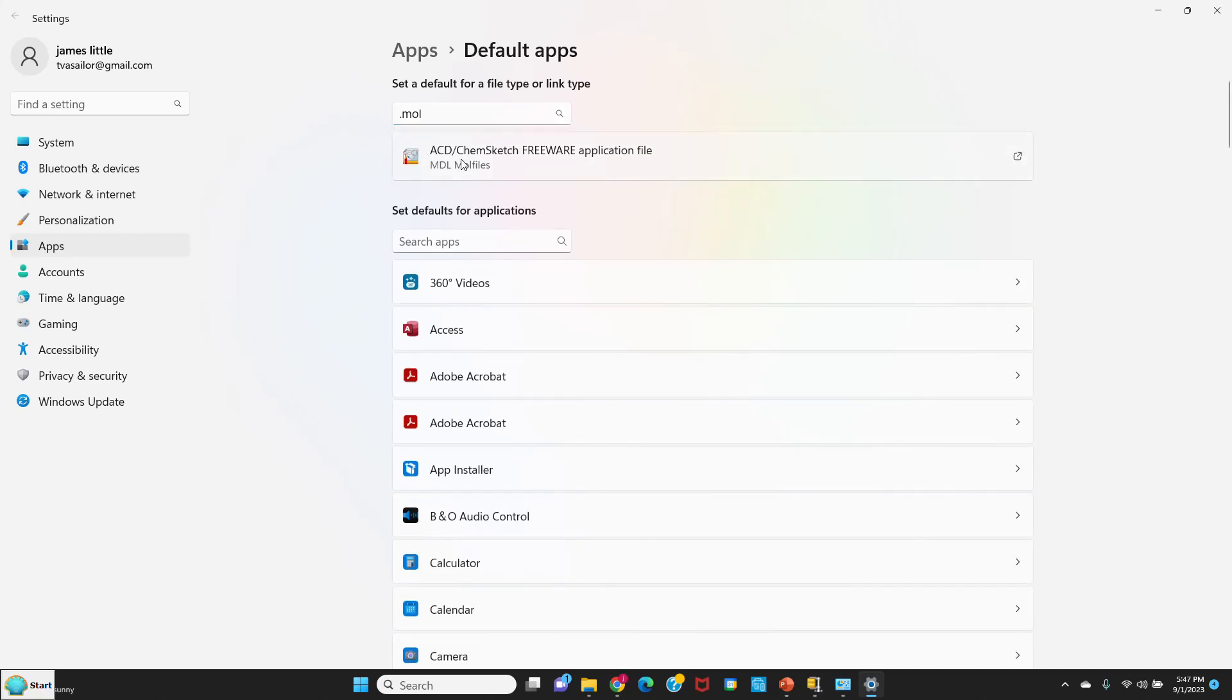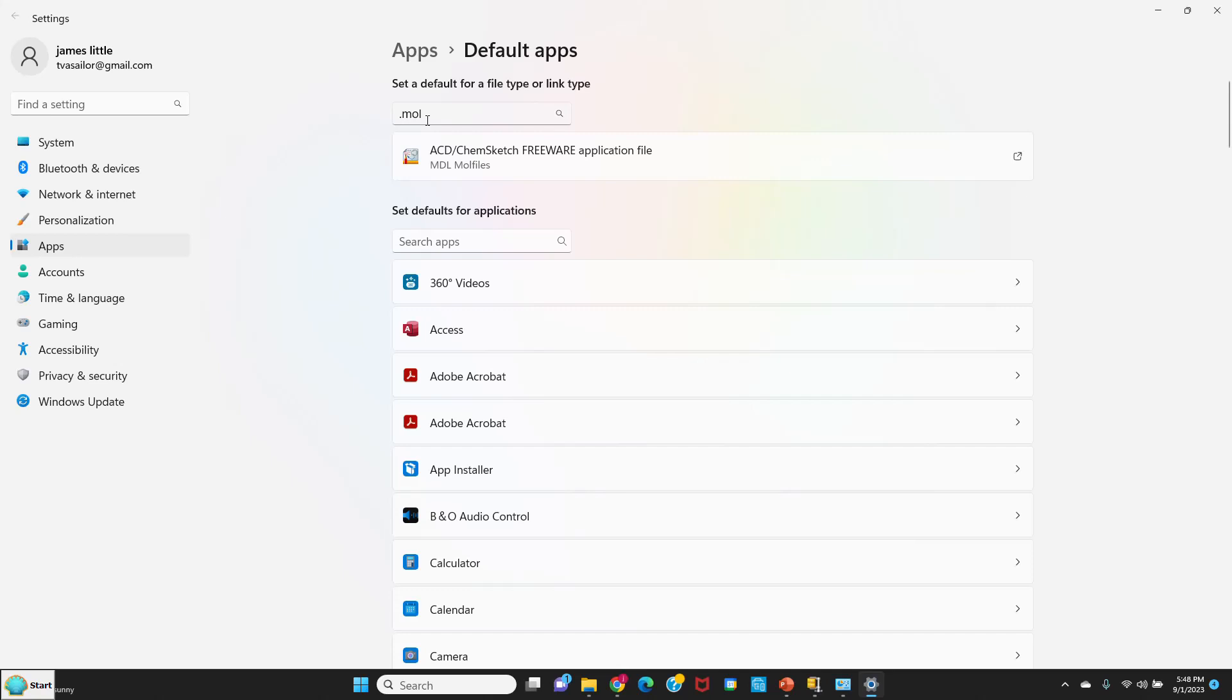So I clicked on it and it brings it up. It says ACD ChemSketch Freeware application file. So it's good. Sometimes if you've had another drawing program on your computer, it might get confused about which one to use for talking back and forth between NIST. It uses this MOL file in the clipboard to do that. So everything looks okay. We should be ready to use the software. Thanks for your attention.